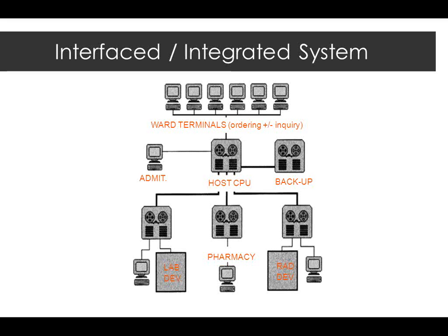The advantage of this is obviously once I can get all the data into this system, now I can do those checks. Now I can look at pharmacy and lab data. Now I can look across systems and try and do that functionality that was kind of the concept of clinical computing. Okay, in a completely separated system where SunQuest and pharmacy and radiology don't really talk to each other, you can't do that kind of cross-discipline checking that this kind of system would allow you to do. Okay?